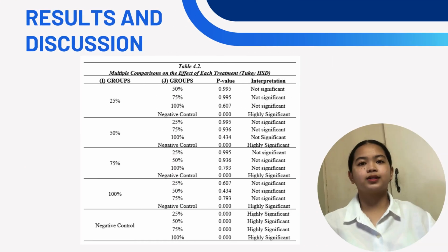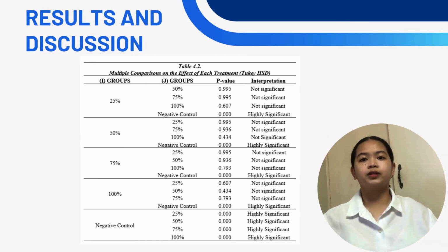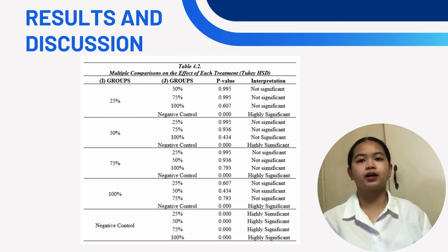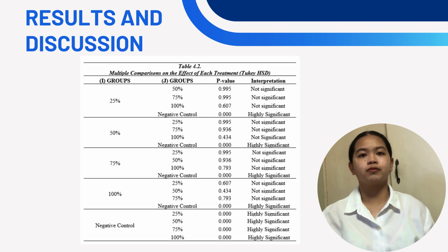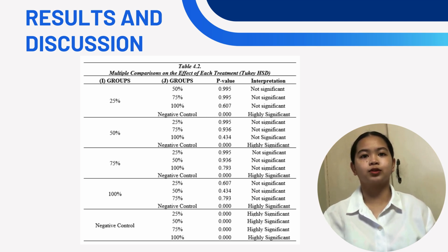The results agreed with the study of Salas and Tataan 2015, wherein the extracts of sabongay, pandan, and siangkubat, containing similar phytochemical components with Santan, exhibited a significant difference in the average number of blood vessel branch points formed by the plant extract when compared to the negative control. With the increase of concentration, a significant decrease is observed in the number of blood vessel branches.